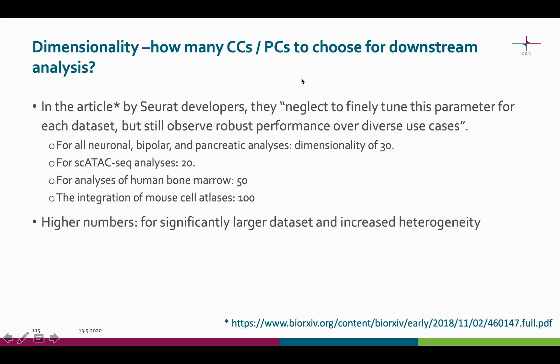In the one-sample pipeline, we use heat maps and the elbow plot to estimate the number of meaningful principal components. Now, in the article where the integration step is described, the Seurat developers say that they neglect to finely tune this parameter for each dataset, but still observe robust performance over diverse use cases. After which, they propose a number of PCs to use in different cases. Again, testing and comparing is the way to go. And if you have a significantly larger dataset or increased heterogeneity in your samples, go ahead and try higher numbers.